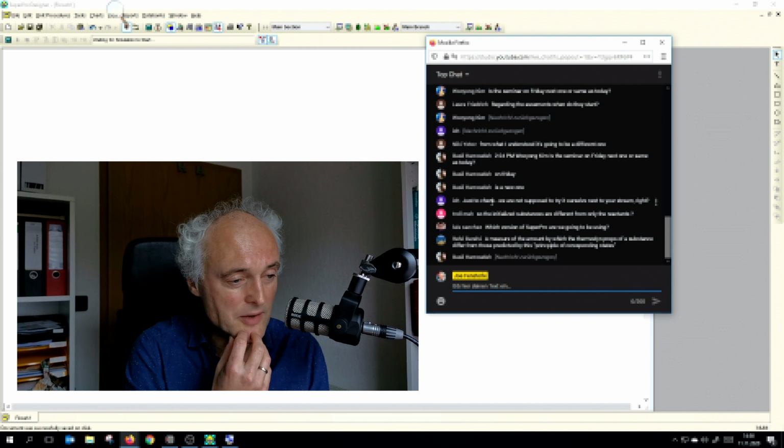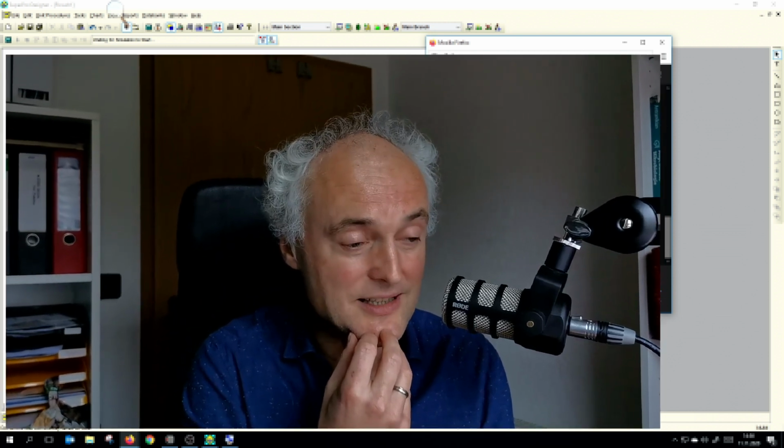Which version of SuperPro are we going to be using? It's SuperPro 10, which is also installed in the rooms. Hopefully it's the 10. I think this is more important: take this sheet and take notes and so on. This helps more. That's the reason why I said print it out.